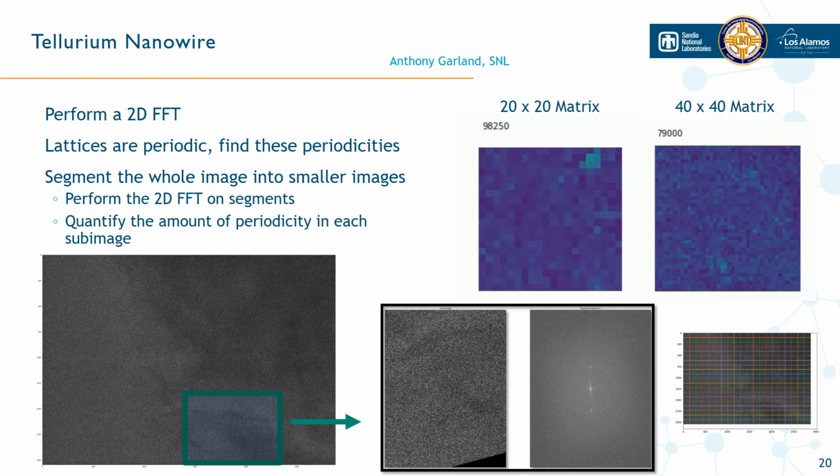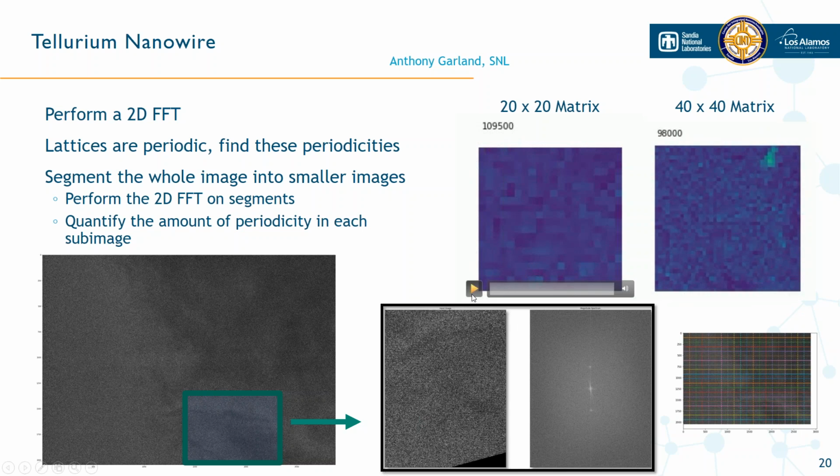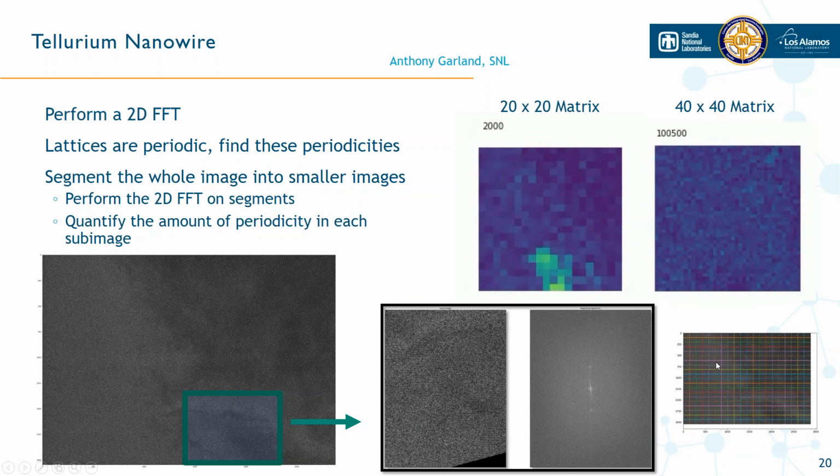I'm just showing that there are strategies that we can use and integrate with the K3IS so that we can do real-time analysis of the data right after we captured it, so we know whether or not we need to go and probe a different structure, or if we've obtained the information that we need. So next slide.